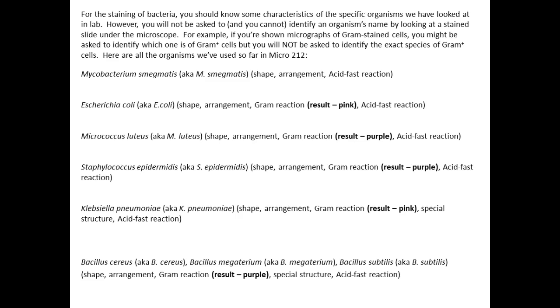He's kind of solitary. When we stain this one, it should come out pink in the gram stain, so it would be gram negative. And then acid-fast, one of the things you'll learn today is only one genus of bacteria. Now notice I'm referring to bacteria. Other things you could stain with this procedure, and some of them would come out acid-fast. But as far as bacteria goes, only the genus Mycobacterium is acid-fast. So can E. coli be acid-fast? No. It's going to be negative. If we were to stain it using the acid-fast procedure, it would not come out that carbolfuchsin color, that pinkish purple color. It would be whatever the counterstain was, like a bluish gray.